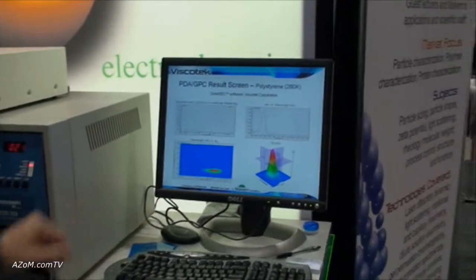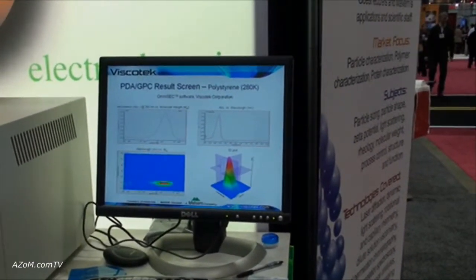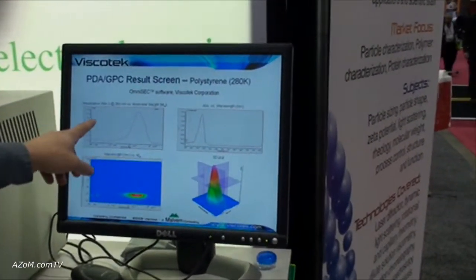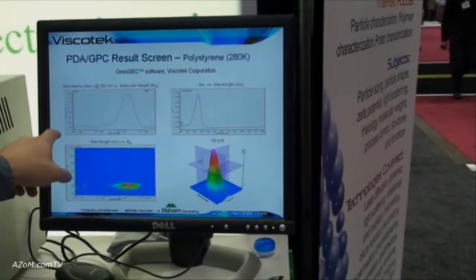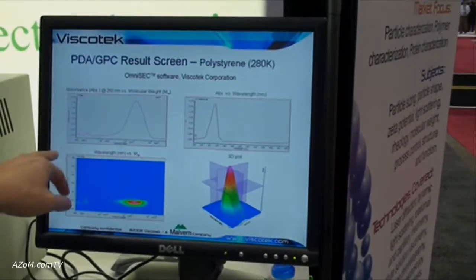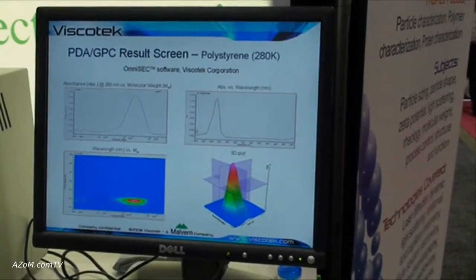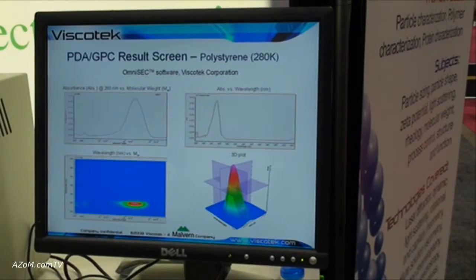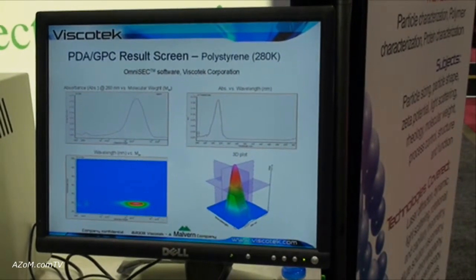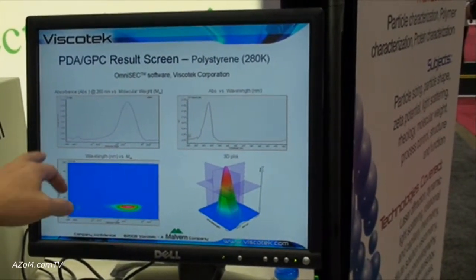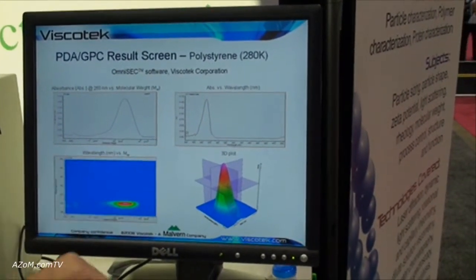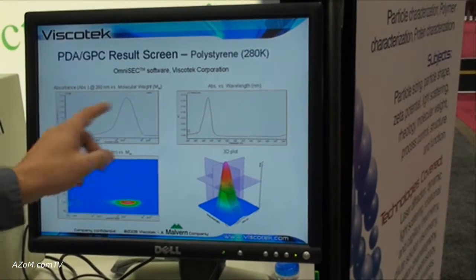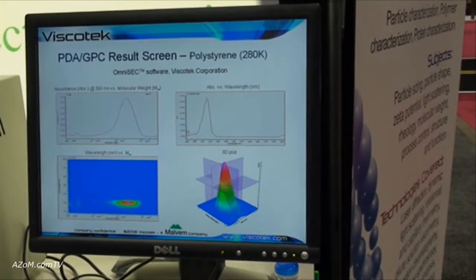Using the OmniSec software, this is the output screen. You can see absorbance at a particular wavelength versus molecular weight. This is a differentiating factor of using the PDA with size exclusion chromatography — you get absolute molecular weights and see how absorption changes across the distribution.